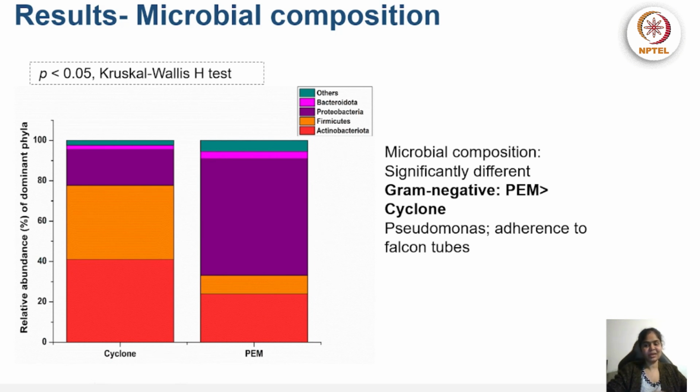So when I have 2 bacilli, even if I have 5 staphylococci, bacilli will have higher genomic copies because they have 10 each. So 2 of them will contribute 20 genomic copies, whereas 5 staphylococci can contribute only 10 genomic copies. So this is one important thing we should remember whenever we quantify: the quantification with qPCR might not be the original concentration, because here the concentration is represented in terms of genomic copies.